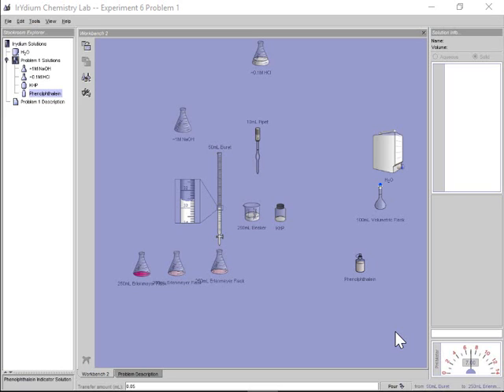We started looking at the technique of a titration. In this example here, we were doing an acid-base titration. Basically, by running through a neutralization reaction, I want to do it so quantitatively that when the color changes, I know when to stop. I know at that case there's no limiting and no excess, and I would have a good count of the unknown particles in the solution.